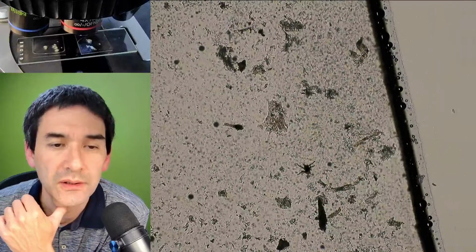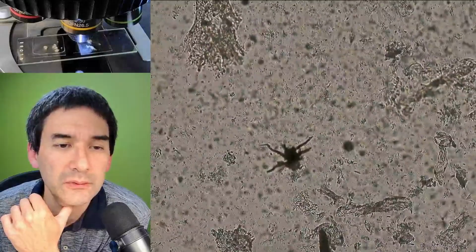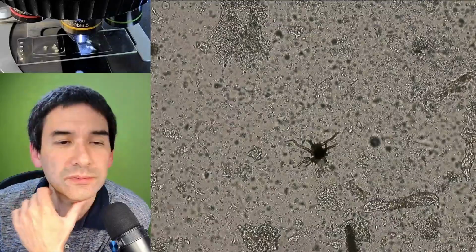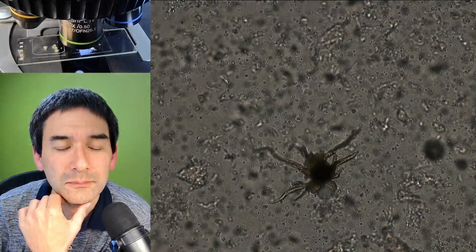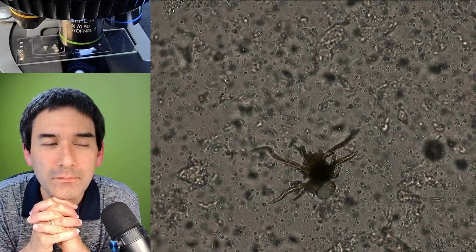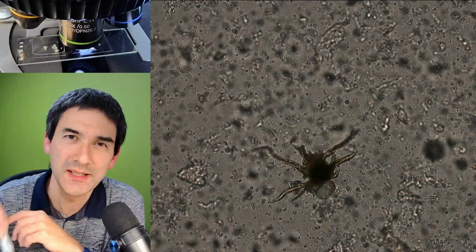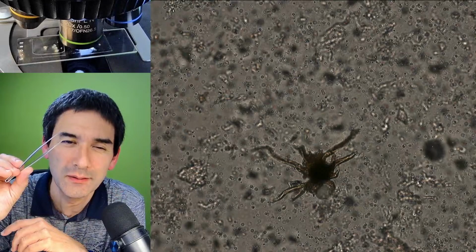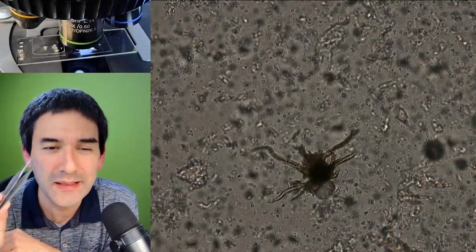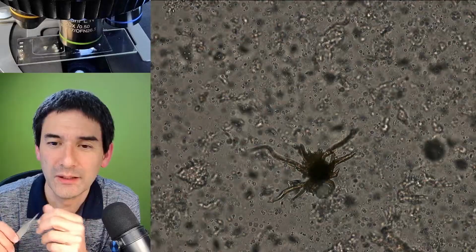Wow, what is this here? This also looks like a trichome. What a nice coincidence. Oh, this is definitely a trichome. Now, let's be careful here. Let's think a little bit. As a scientist, you've got to be careful. Did I use those tweezers to actually pick it out? This could, of course, be a contaminant from the tool here.